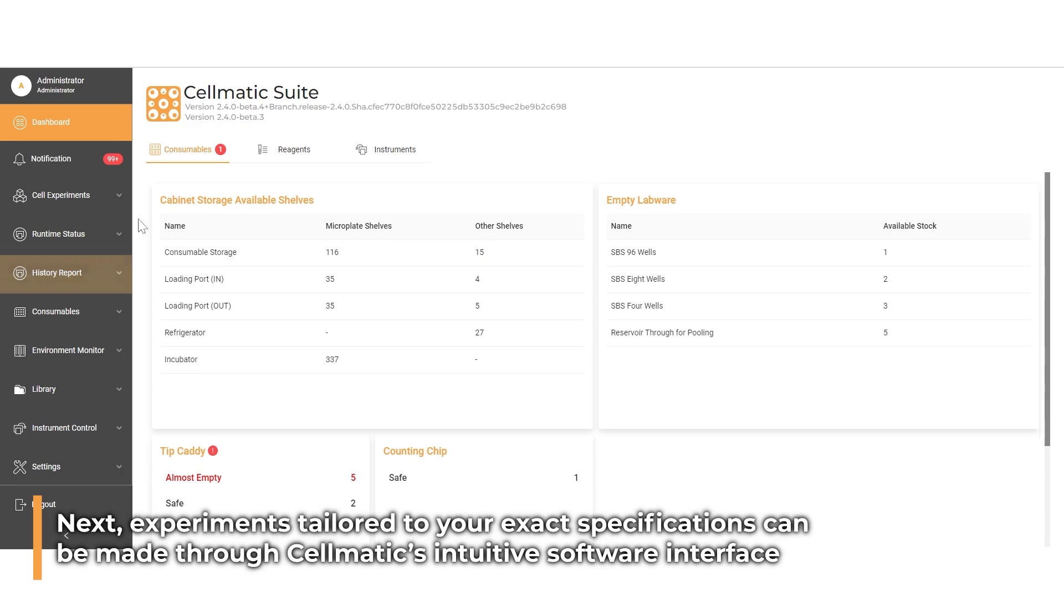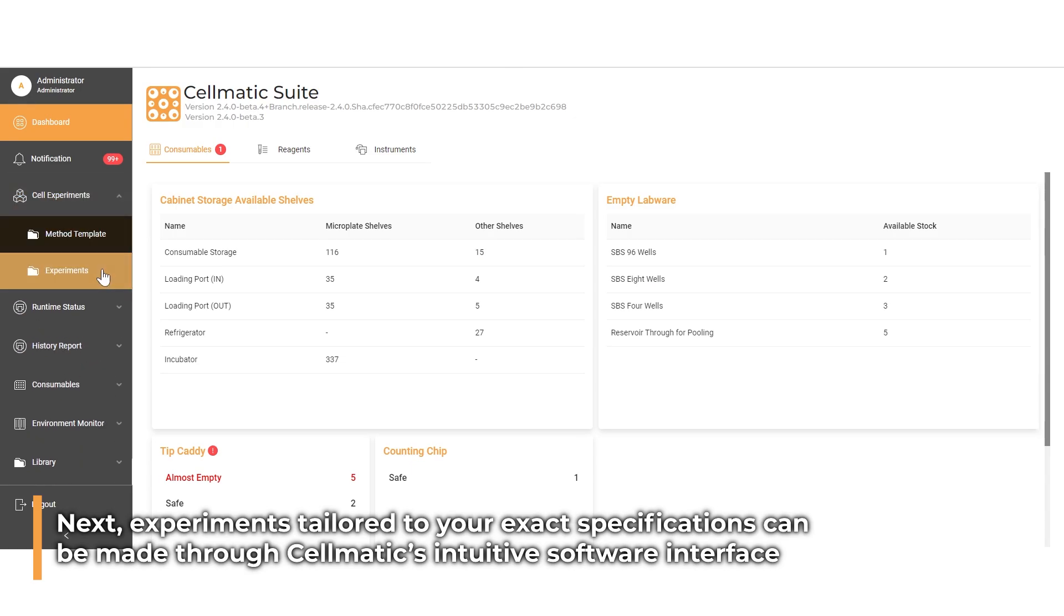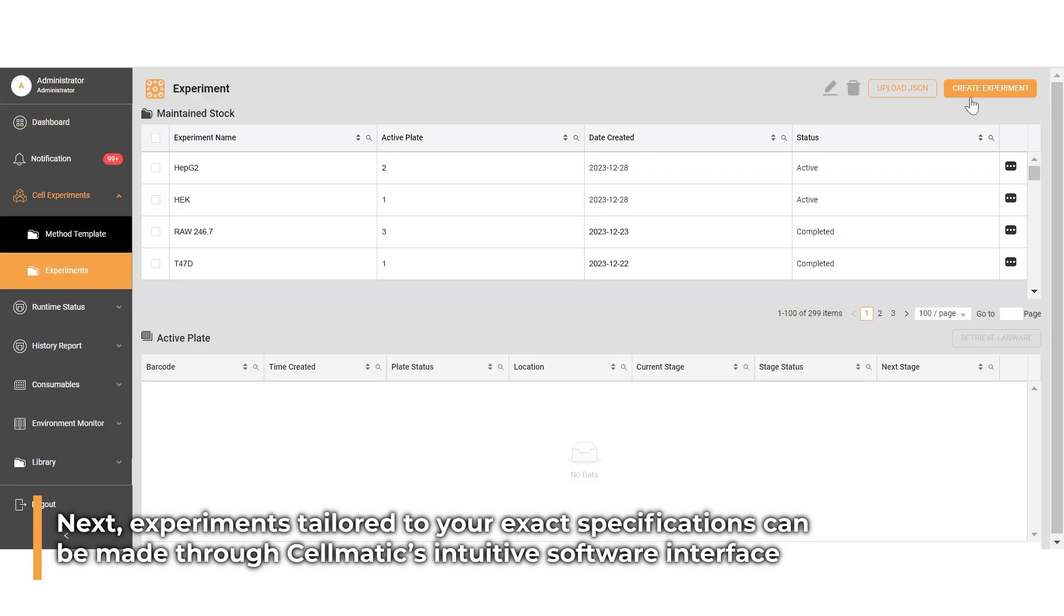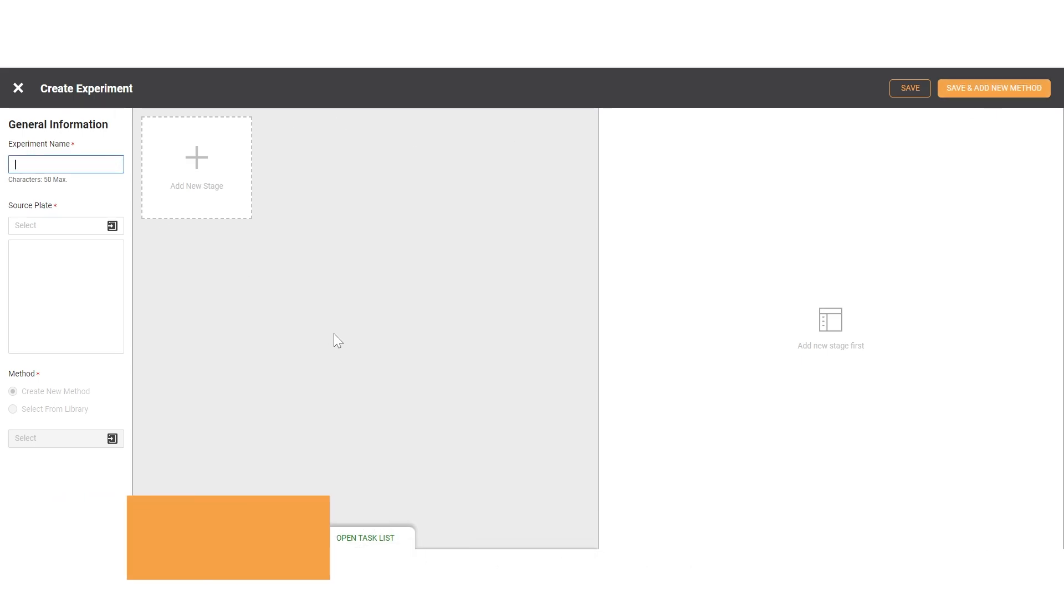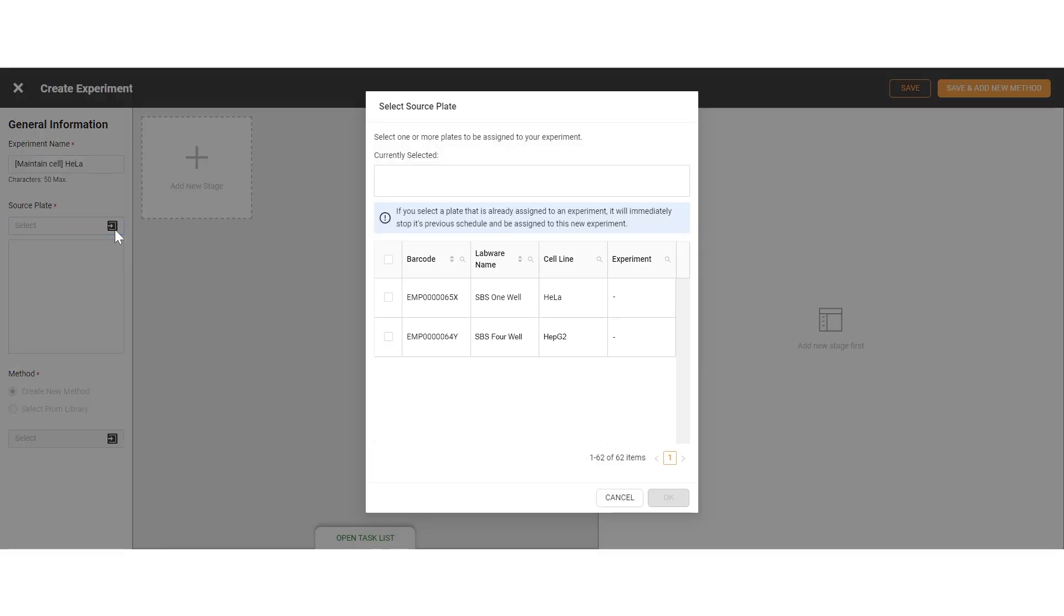Users can input comprehensive information regarding the plate's content and conveniently select the optimal storage location. Next, creating experiments tailored to your exact specifications is made effortless through Cellmatic's intuitive interface.